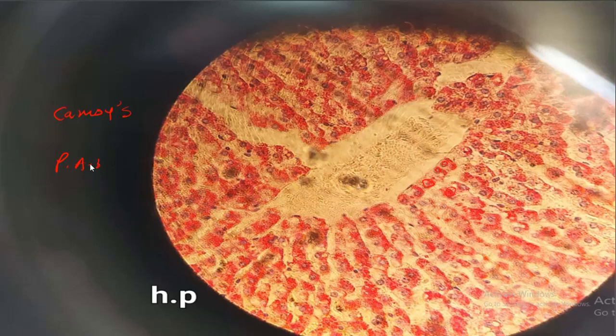When PAS is used, it stains these glycogen granules red, and we see prominent nuclei. You are able to draw a few cells from here as assigned by your demonstrator or tutors.